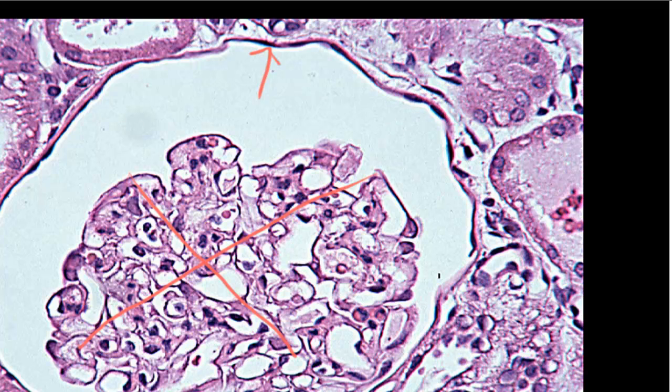This area is surrounded by a very thin epithelium. And in almost all histological preparations, nuclei are going to stain blue. If you look right here, you see a couple of nuclei. And if you look closely at these nuclei, you can see that they're flattened. And if you look at these cells, you see that they look something like this, indicating that the epithelium around this renal corpuscle is a squamous epithelium.